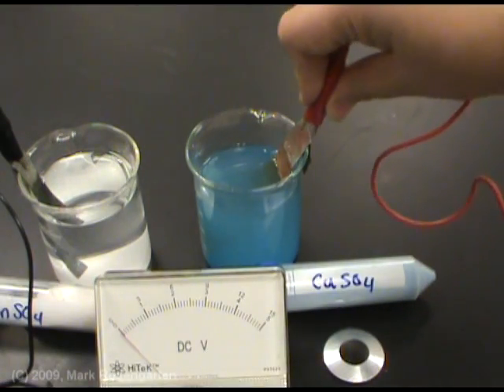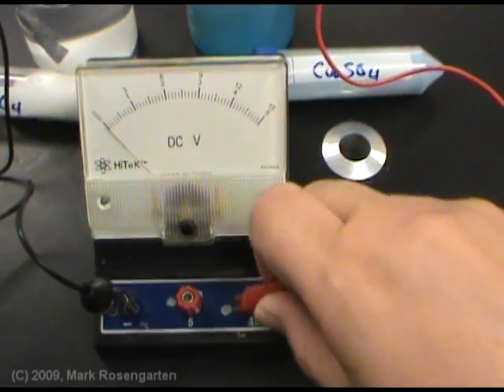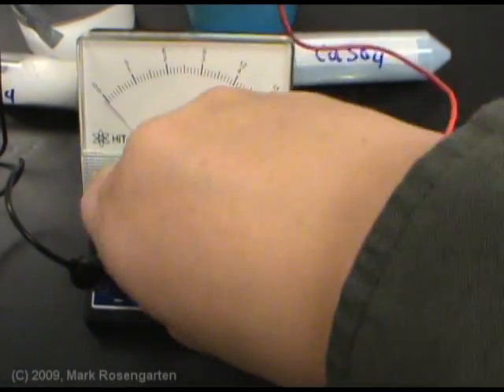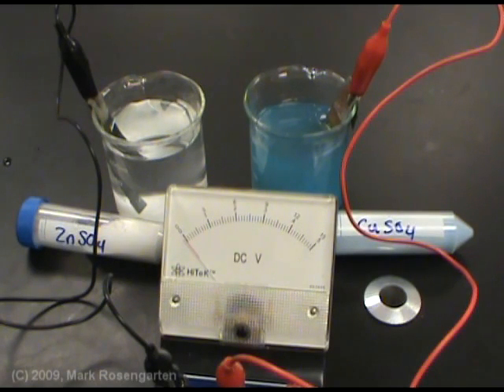Then we hook the copper up to the positive terminal of our voltmeter. Now, apparently, there's nothing happening. Our voltage is still zero.